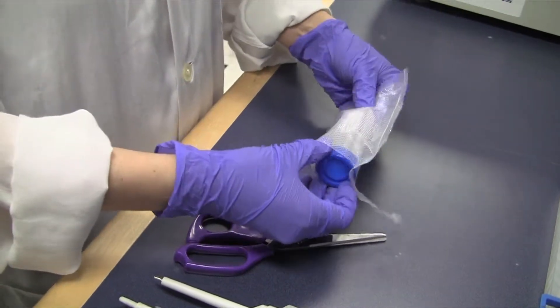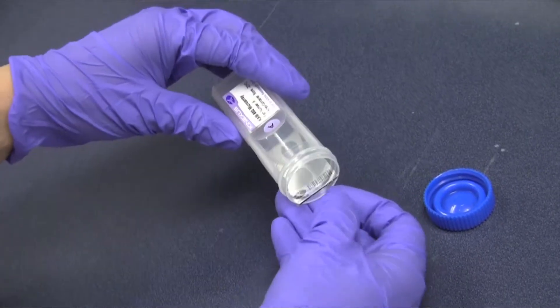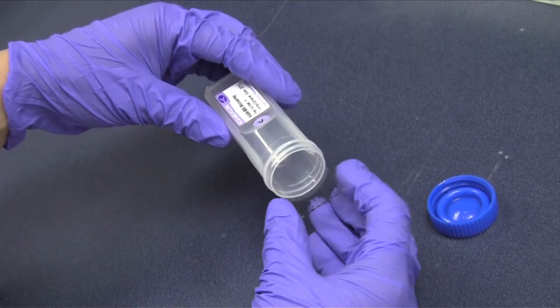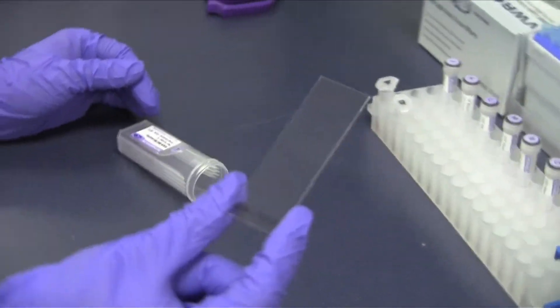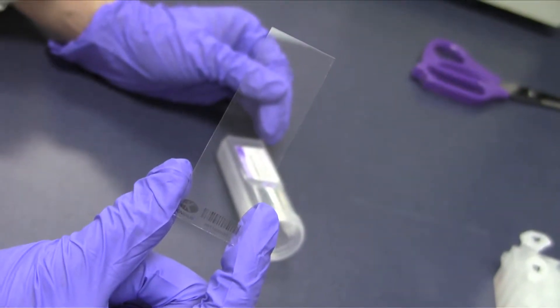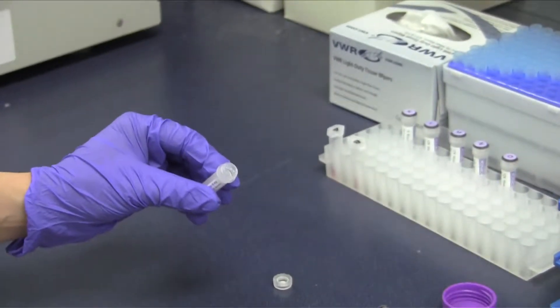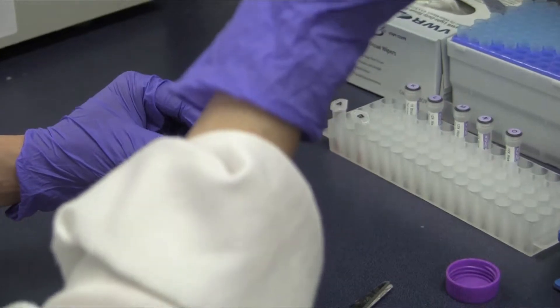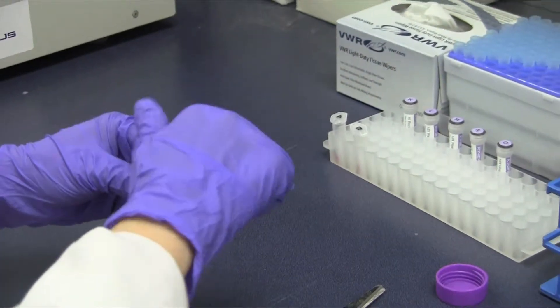Unscrew the cap of the microarray slide container and retrieve the CAM antibody microarray part CAM-A using a gloved hand and without touching any array surface area. Place the array on the bench surface with the antibody side facing up towards you so you can see the Conexus logo and read the barcode at the bottom of the array. Save the microarray slide container for subsequent blocking and washing steps.